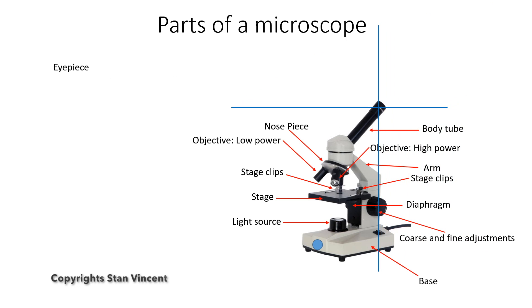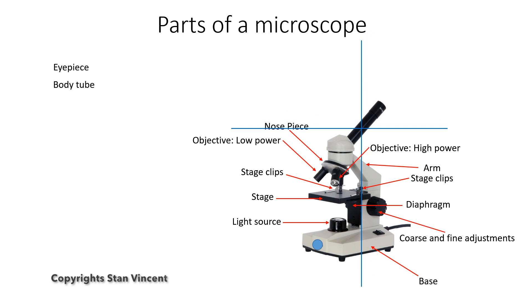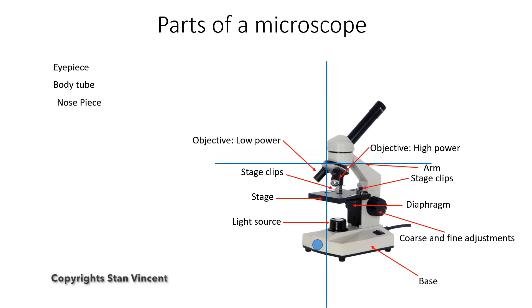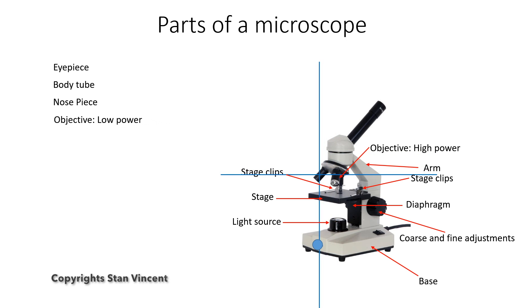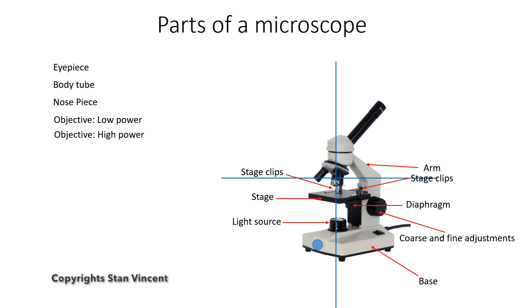The eyepiece. The body tube. The nose piece. The objective lens — the low powered one. The objective lens — the high powered one. There are three: 4x, 10x, and 40x.